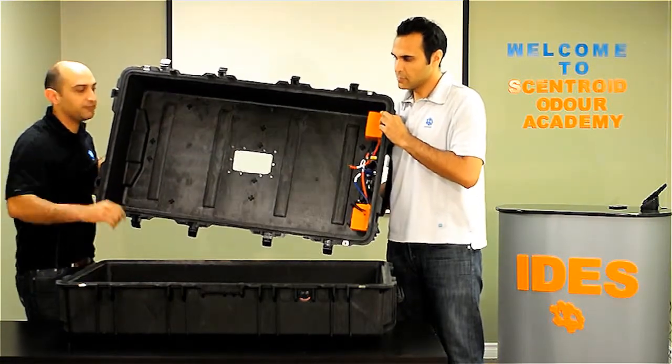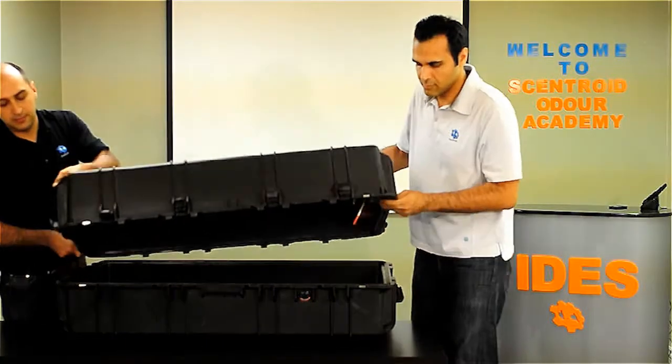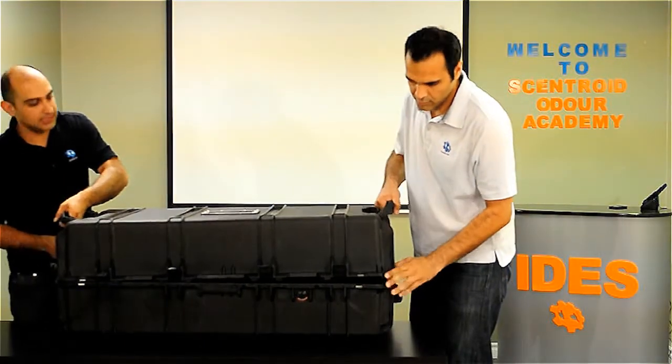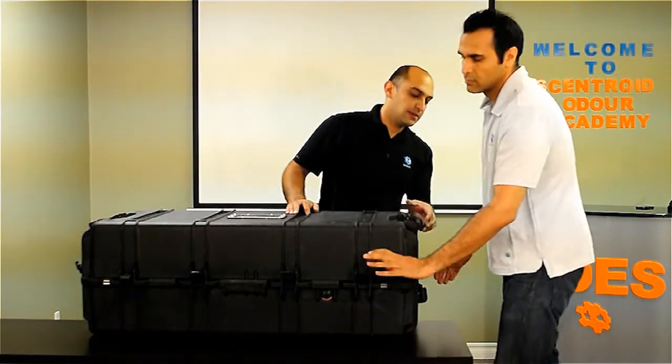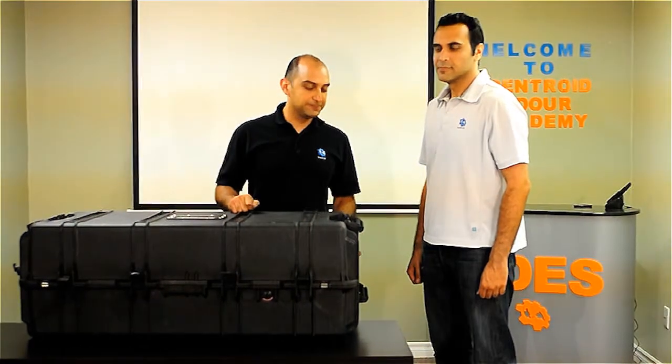You put the bag in, connect the fitting here, close the lid, and click the switch. All our vacuum chambers have a built-in battery, but you can recharge them using a car battery or normal 110 to 220 volts AC from household power. That's it — thank you very much for watching. Check out our other YouTube videos and our webpage at centroid.com.